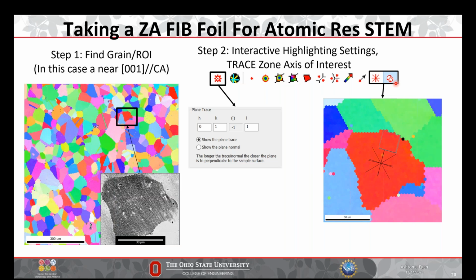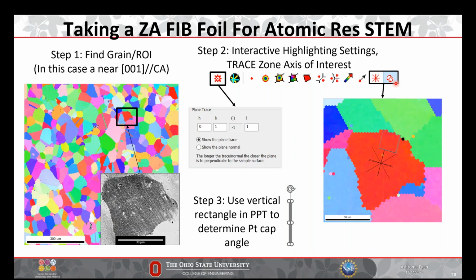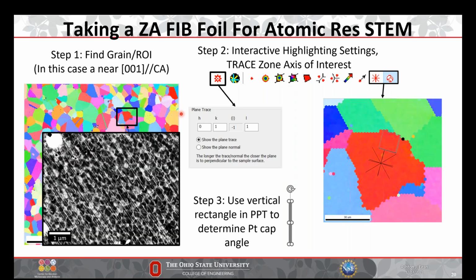And so which one do we actually take? Because there's two, right? Now we kind of have to think about our ECCI orientation, and how these are laid out in real space. And so basically, if we look at the traces of these deformed traces, or these stacking fault microtwins, they're diagonal.